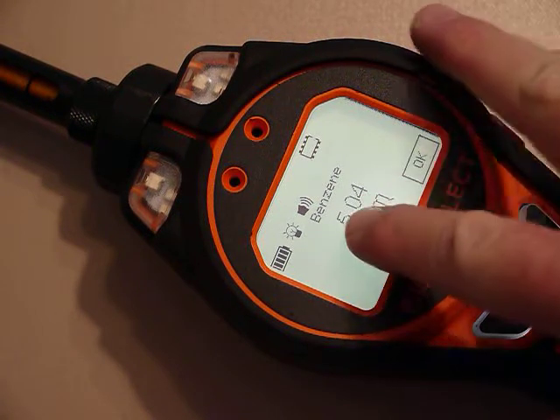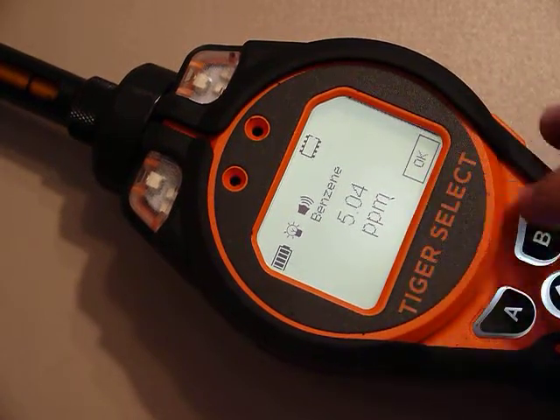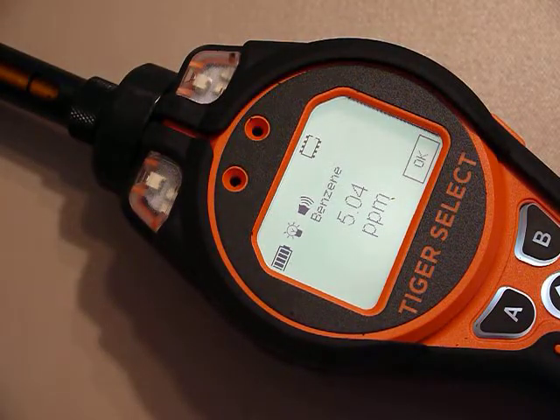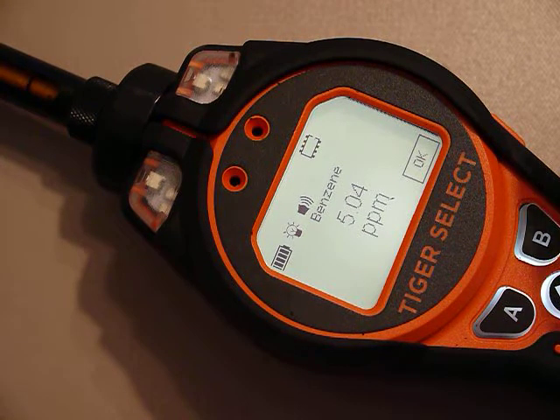That's our benzene reading. The calibration gas I used was 5 ppm, and so that's pretty close. When you look at the small differences in the gas concentration, that might well be the correct value. Anyway, that's how to take a benzene measurement.